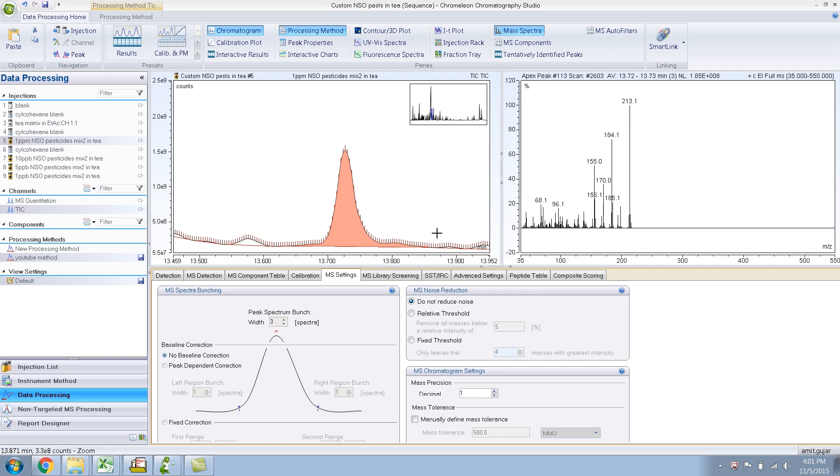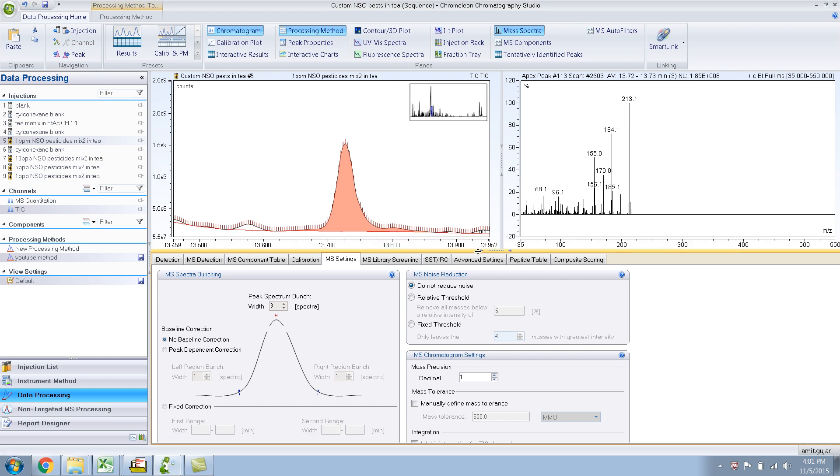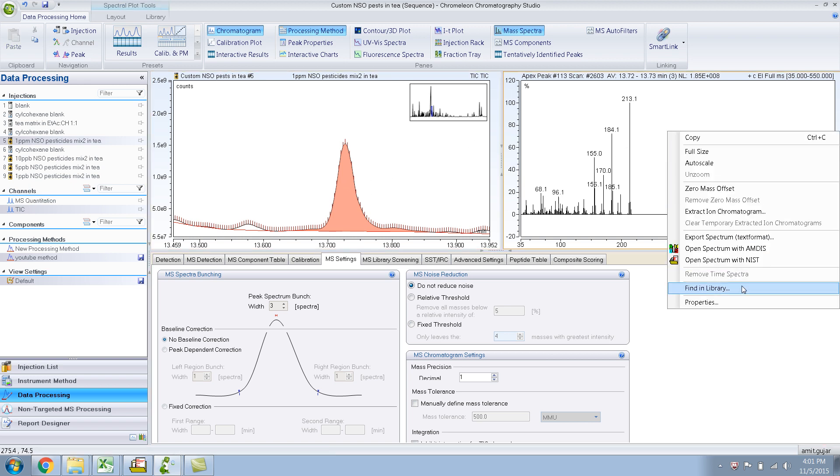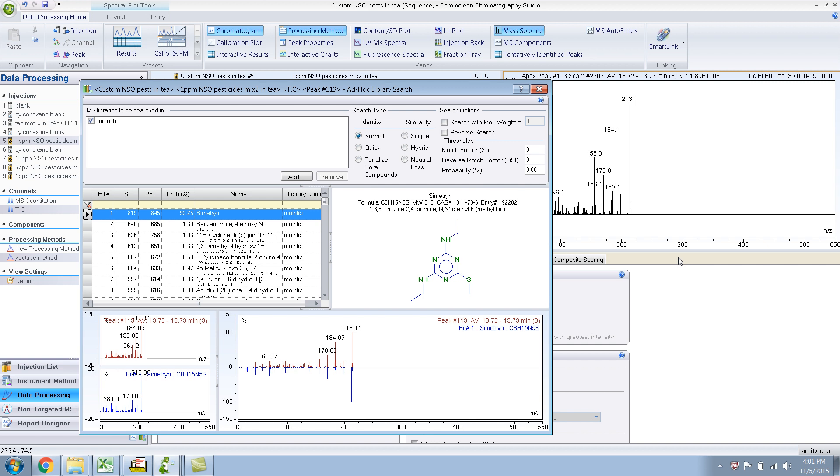Okay, in the last video I showed you something about MS settings, the mass precision and baseline correction. Like I said, this peak, if I do a library search, shows Simetryn. But obviously, the NIST hit itself does not show any 184, so that means there's a coeluting peak.